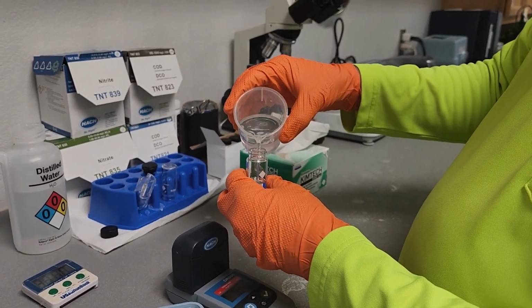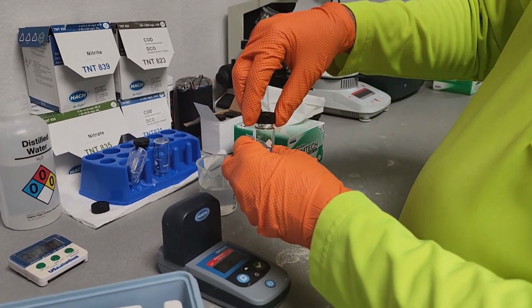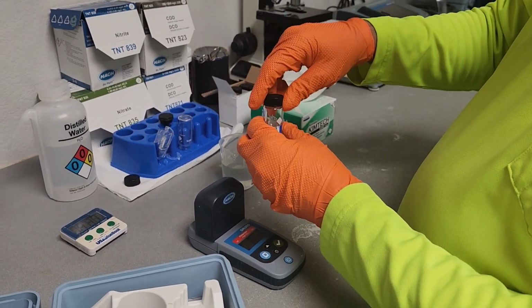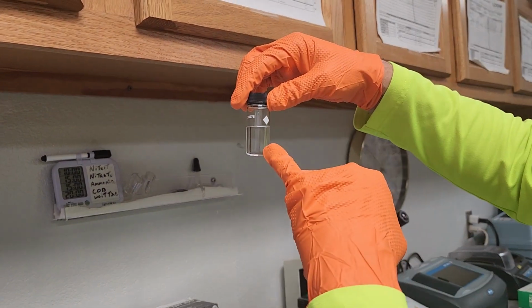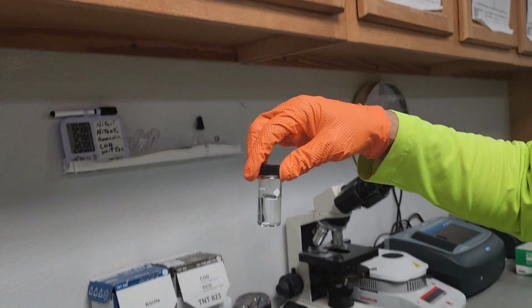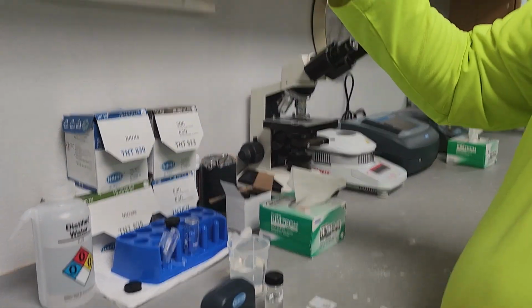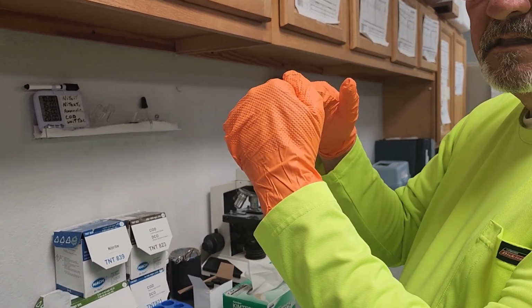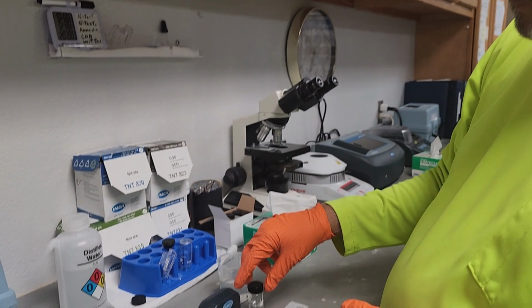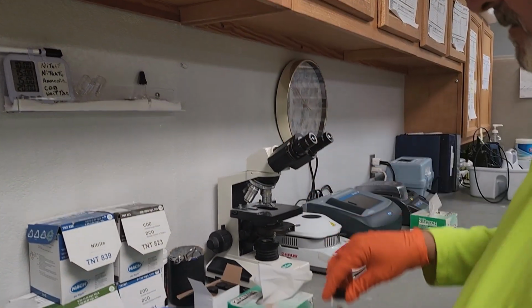For the sake of this video, we're just going to go ahead and pretend that we've already done that. Now, fill the sample cell to that line, and look, because in these sample cells there will be a slight meniscus. A meniscus is that curvature of the water. At the edges, it's going to be higher than it is in the middle. And you want the bottom of the meniscus to be at that line.